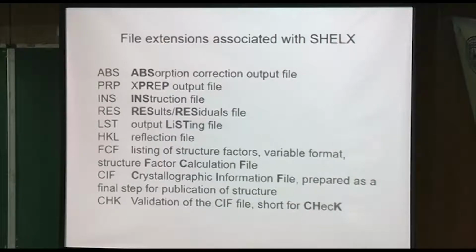Okay, FCF stands for structure factors. I'm not exactly sure what the FC part is, but these are listings of structure factors, probably a structure factor calculation file. It used to be required a lot, but we don't really look at them very much anymore. It's a big listing of FOBS versus FCalc, with different kinds of formats depending on what you tell it to do.